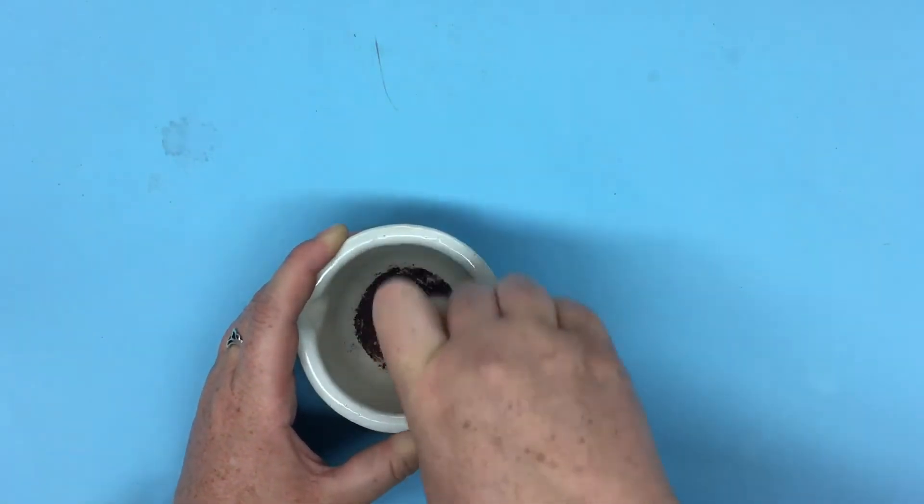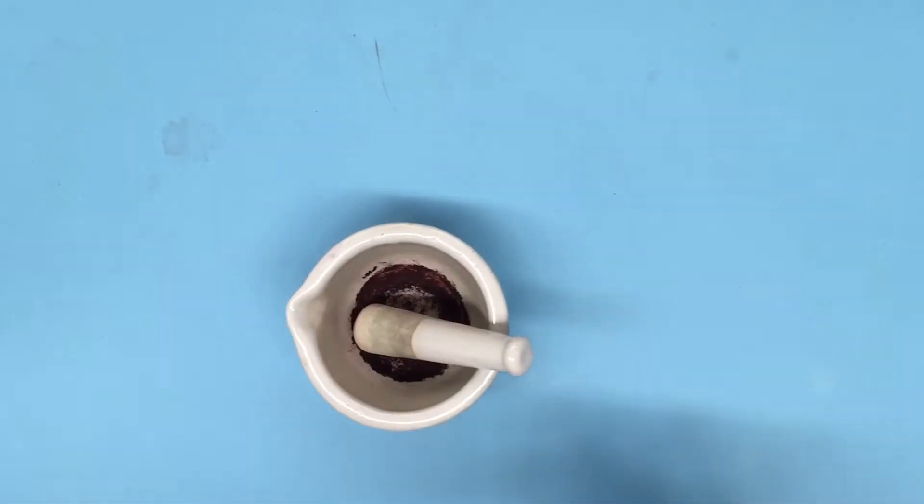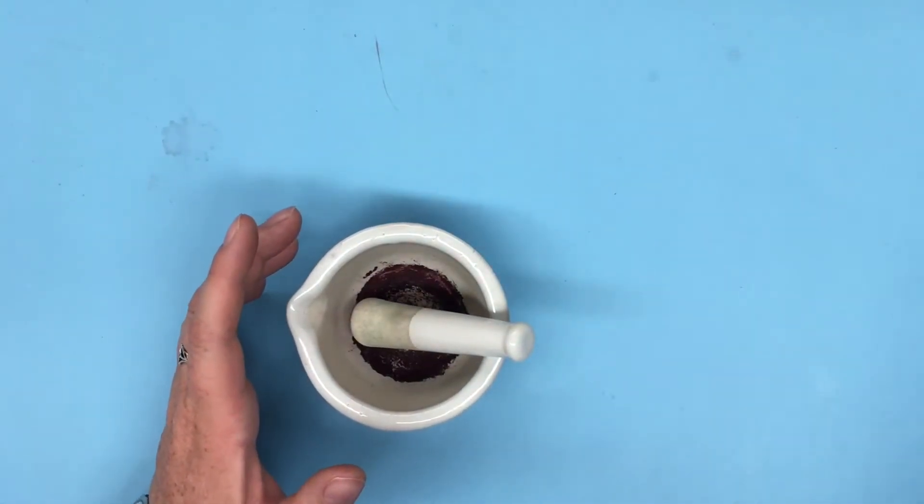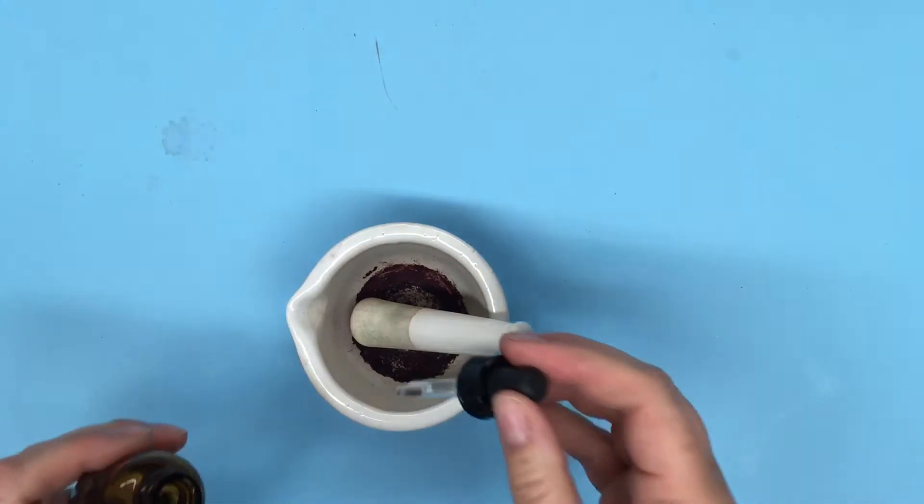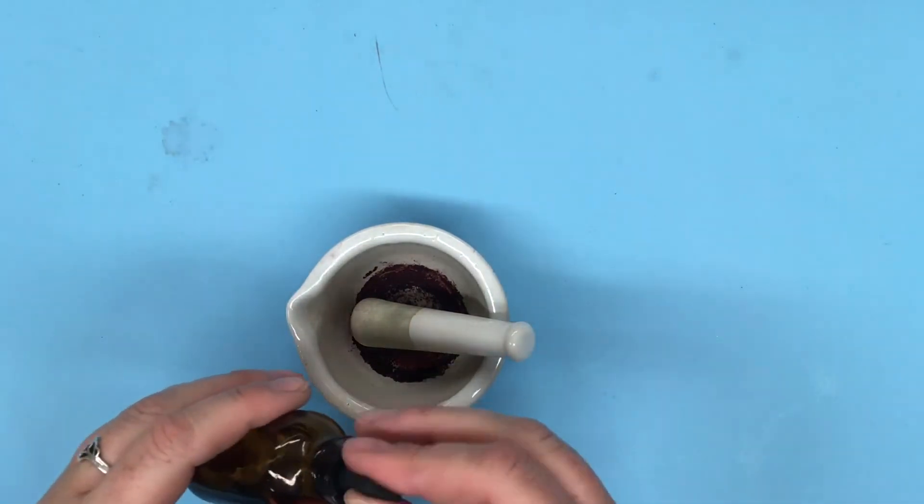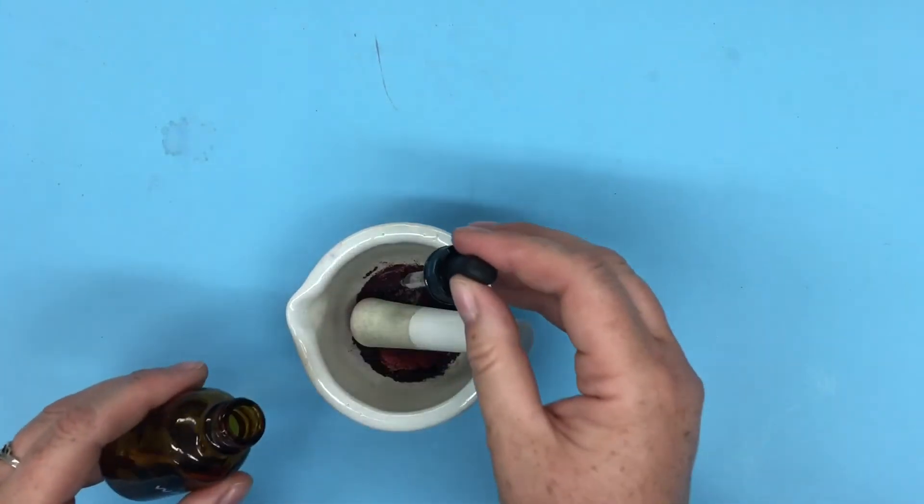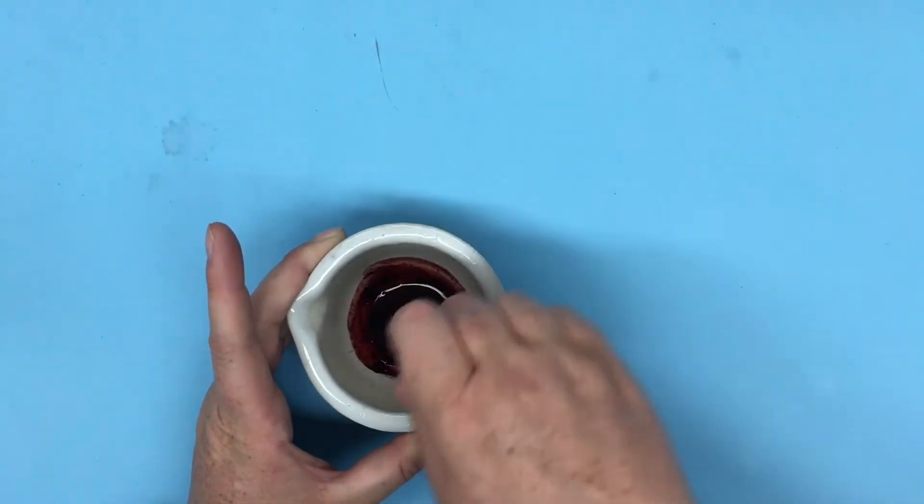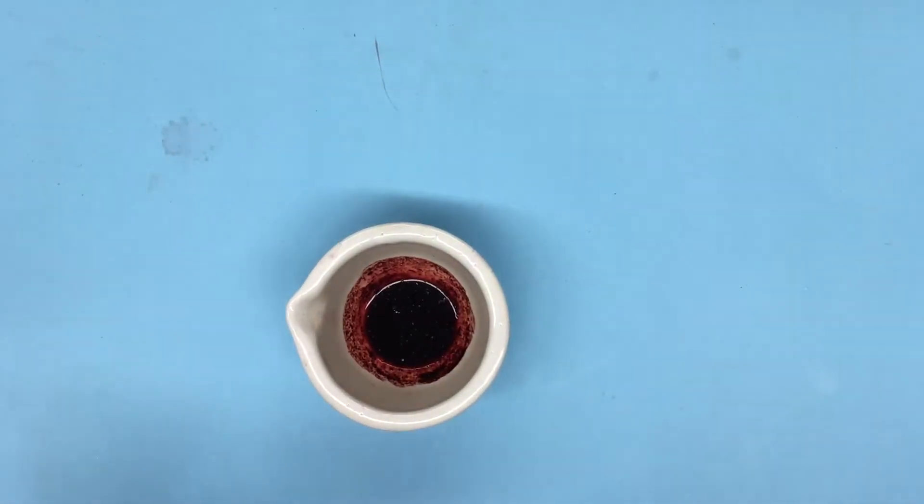So we're going to grind some of those up right here. Carminic acid is pH sensitive and will change color with the addition of an acid or a base. So to start, I'm going to add a little bit of distilled water into our ground up cochineal insects. That's the common name for these bugs. Only the females are used in producing dye. There we go. We can see that it produces a dark red color.